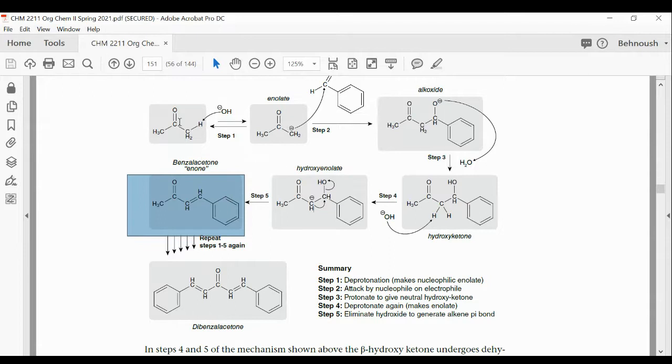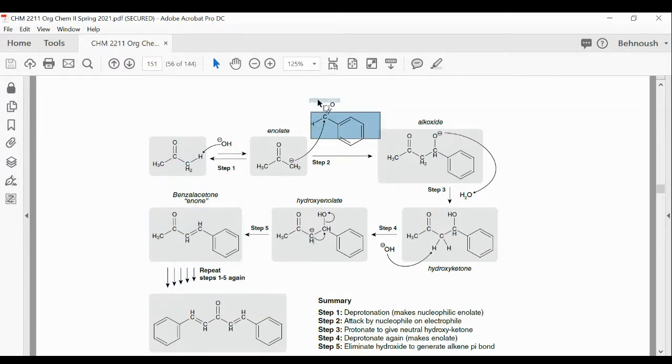Now, if you look at this mechanism of reaction, you see that for every mole of acetone, you need 2 moles of benzaldehyde. What else can we use this mechanism for? Your reactants are acetone and benzaldehyde. If you do IR spectroscopy of acetone, the C=O double bond would show a peak.